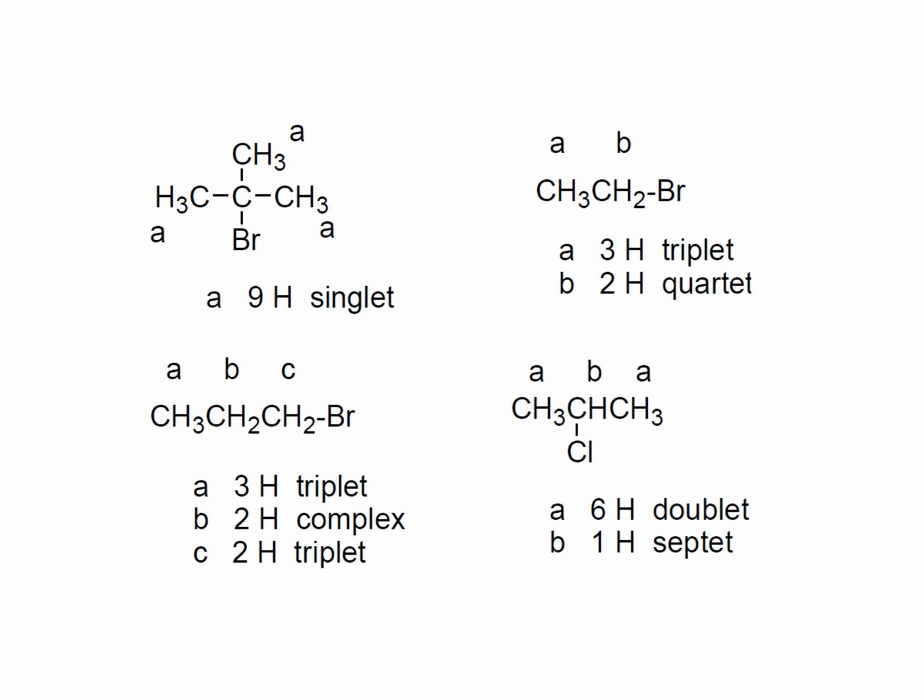Now look at this phenomenon. Here is one environment, 9 hydrogen, but a singlet. Why singlet? Because of the one environment. For one environment it will always be a singlet. But think about this case. For two environments we will have multiple splitting. For this A, it actually depends on the nearby atom. Just think about A. It has CH3, for which we have provided 3H, no problem.